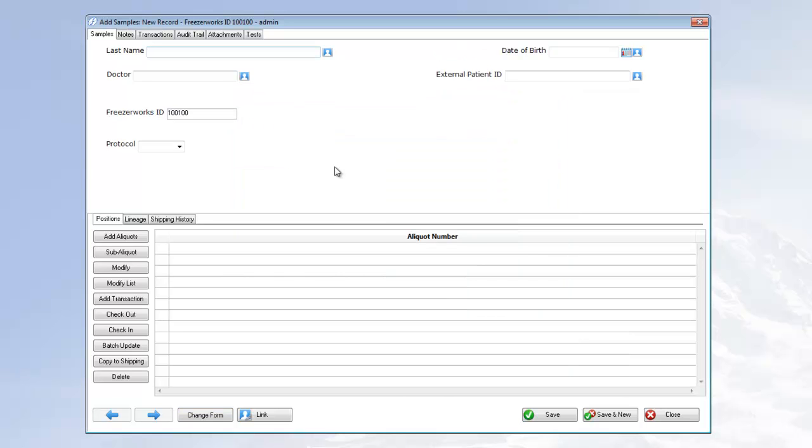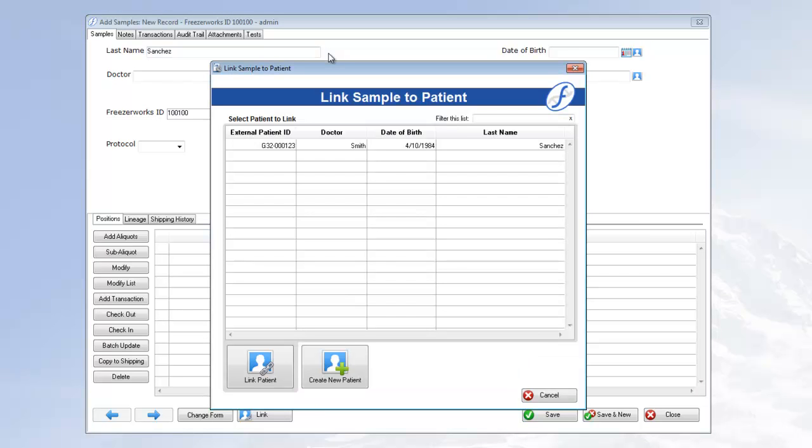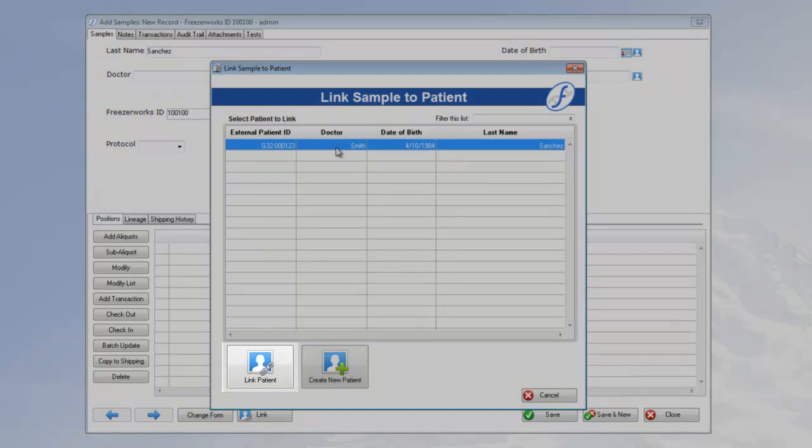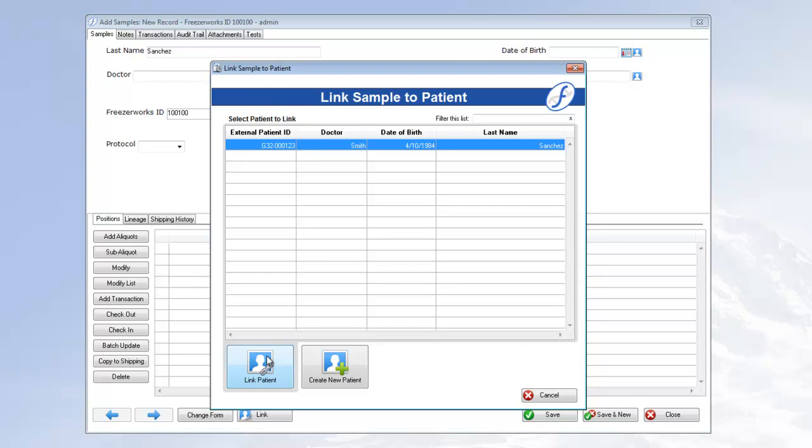Now, if you are linking the sample to an existing patient in the database and you have the information ready, you can enter the necessary data into the patient fields. Note that you only need to enter data into one patient field in order to link it. Once you've got a field filled, click the patient icon to the right of the field. The program will display any patient records that match that entry. If you see the correct patient, highlight it and click the Link Patient button, which will automatically fill the rest of the patient fields on your form with the newly linked patient's existing data.